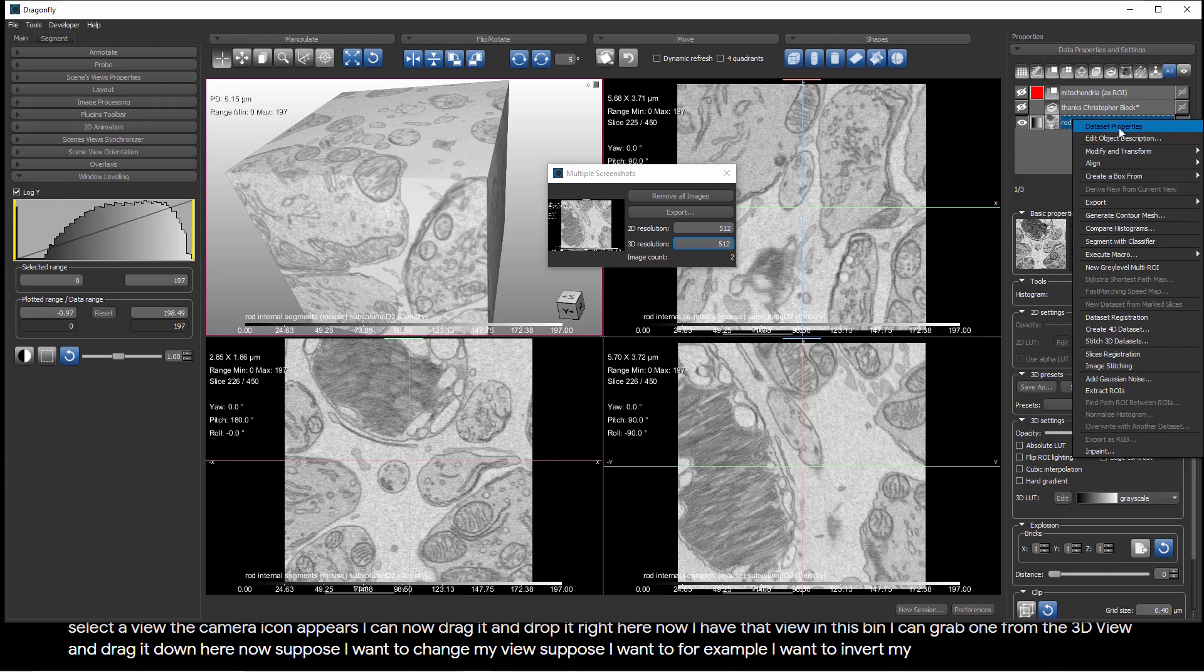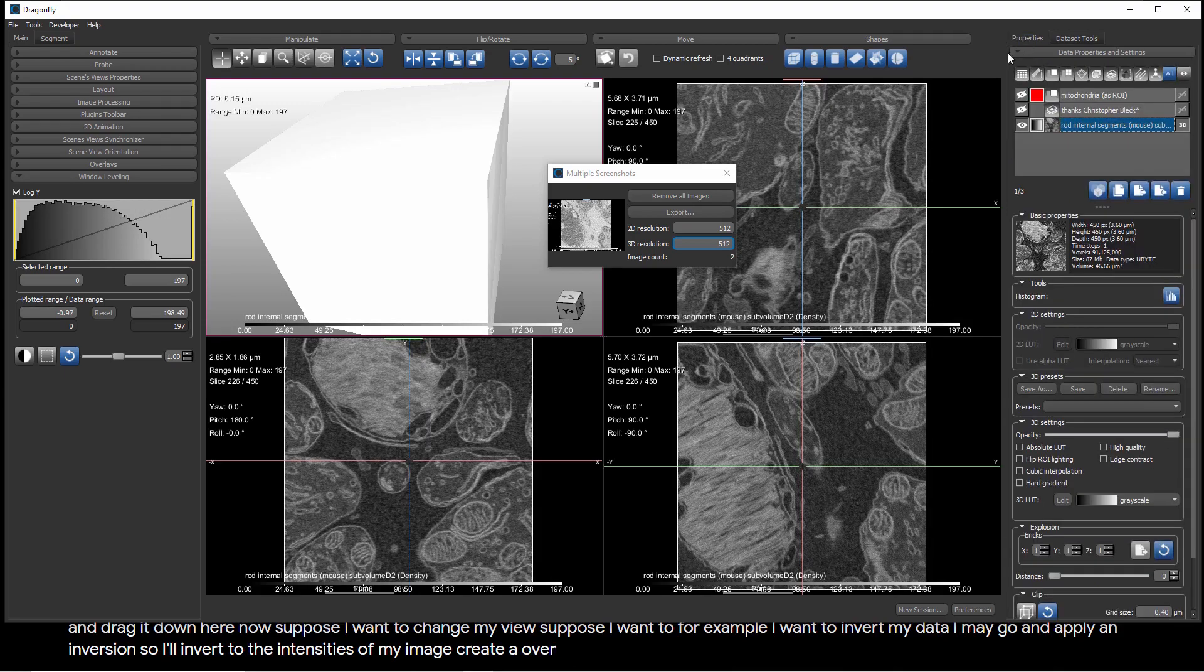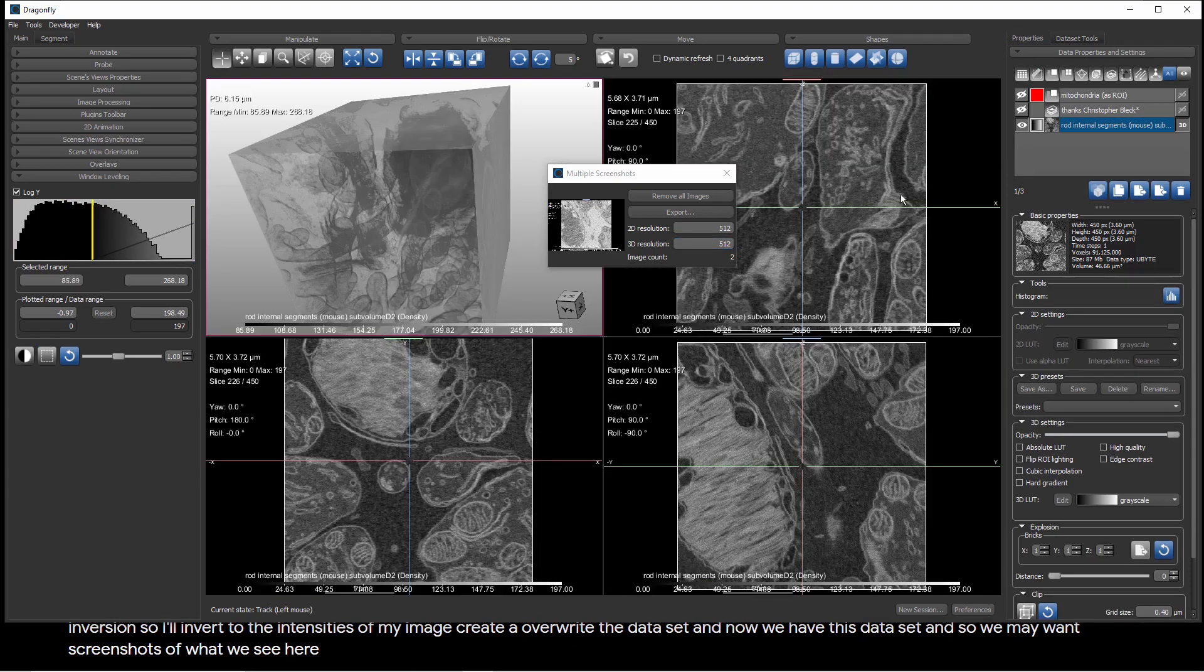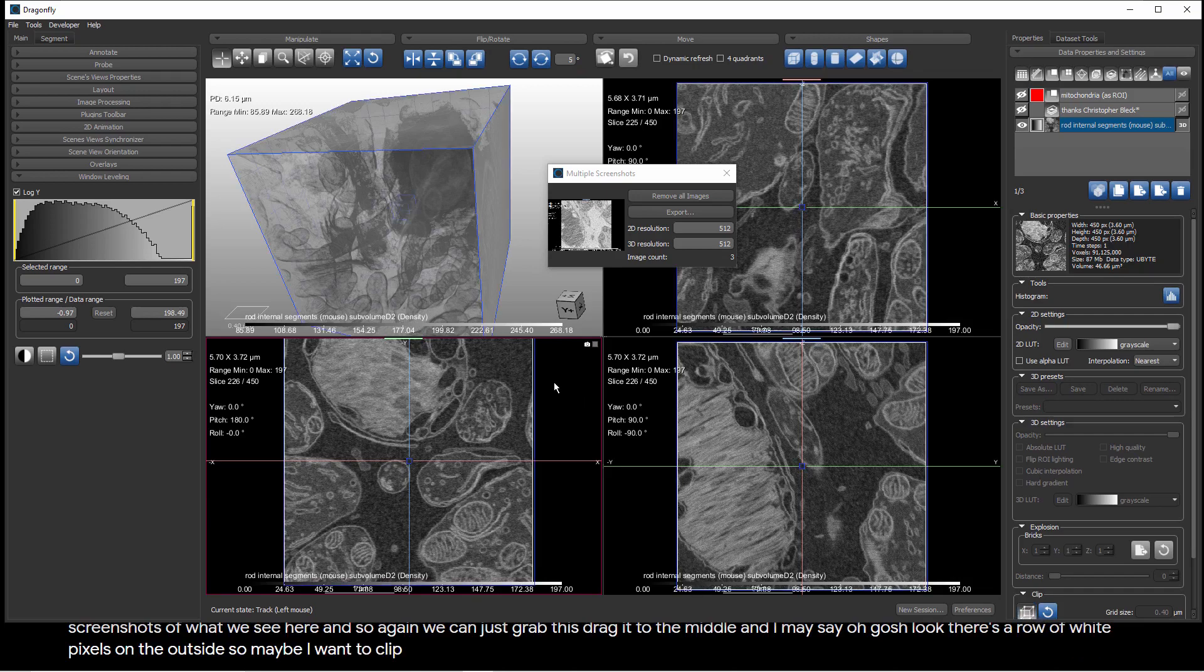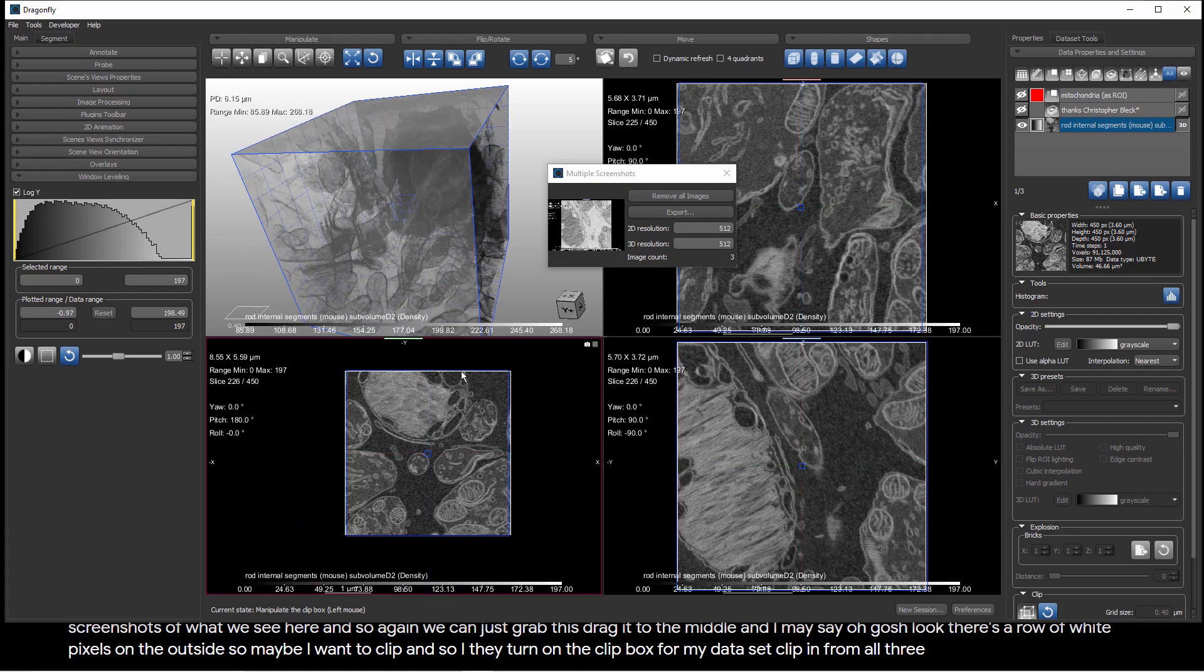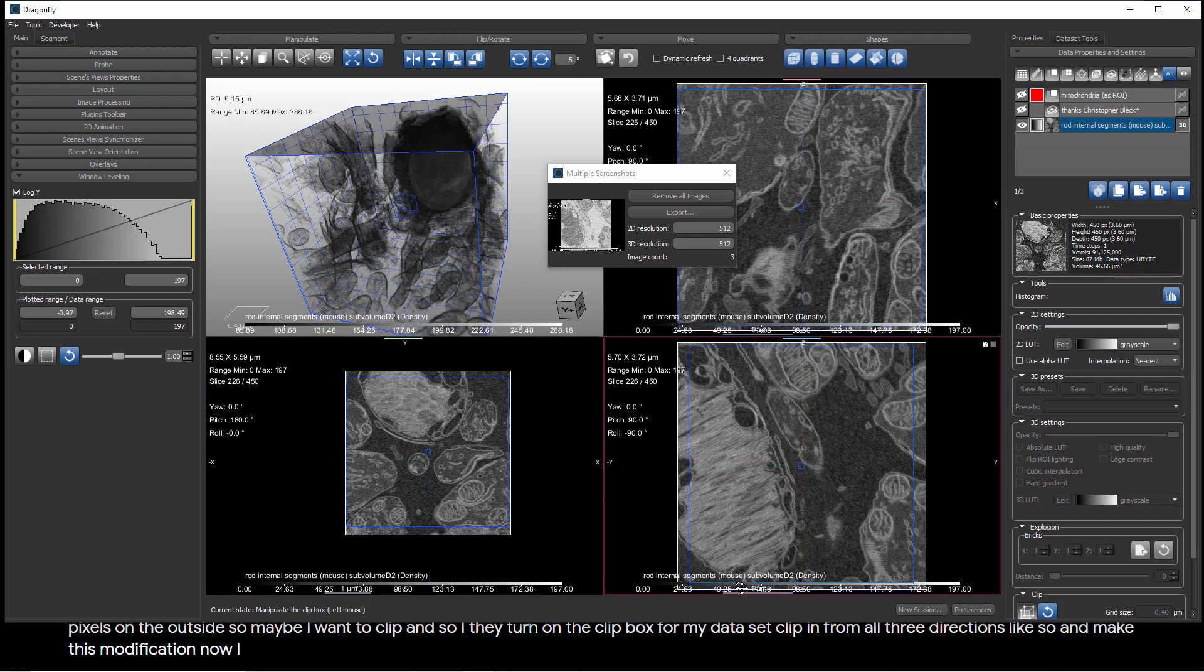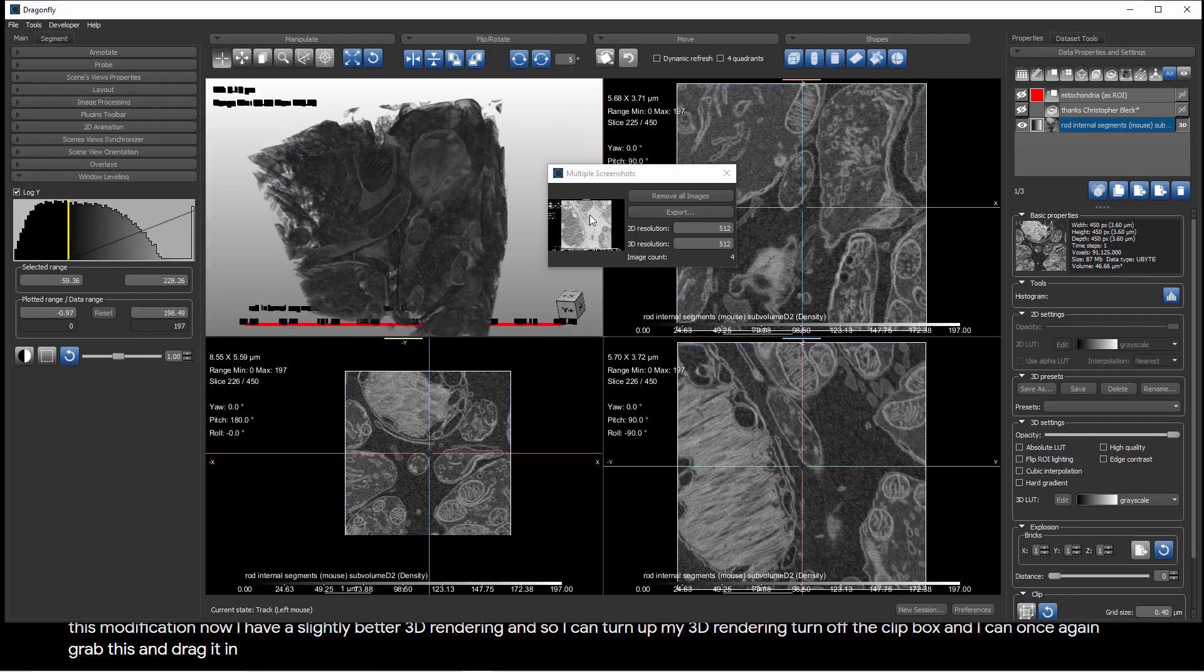Now, suppose I want to change my view. Suppose I want to, for example, invert my data. I may go and apply an inversion. So, I'll invert the intensities of my image, overwrite the data set, and now we have this data set. We may want screenshots of what we see here. And so, again, we can just grab this, drag it to the middle. I may say, oh, gosh, look, there's a row of white pixels on the outside, so maybe I want to clip. And so, I may turn on the clip box from my data set, clip in from all three directions, and make this modification. Now, I have a slightly better 3D rendering, and so I can turn up my 3D rendering, turn off the clip box, and I can, once again, grab this and drag it in.